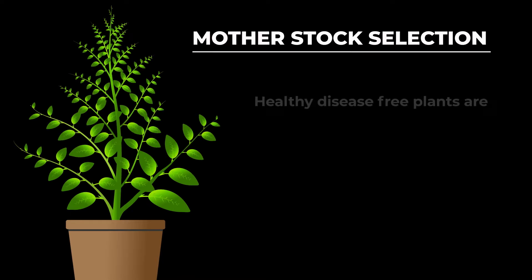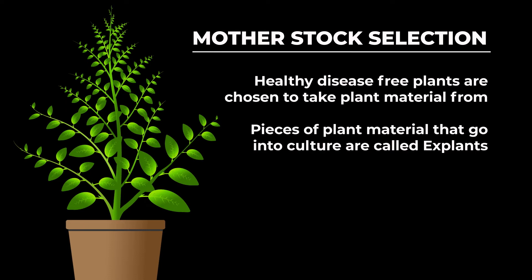The first part is cleaning up some plant material and getting it into the lab. We need a plant. This one looks good, healthy and growing strong. We'll need to take some plant material from this plant to put it into the lab. We'll call this plant material explants.